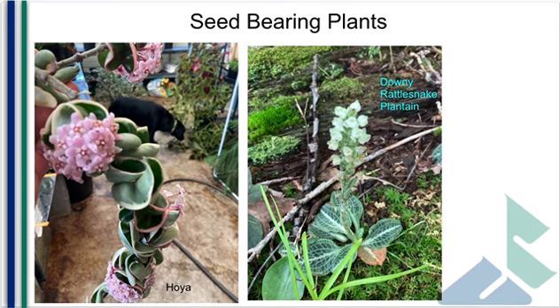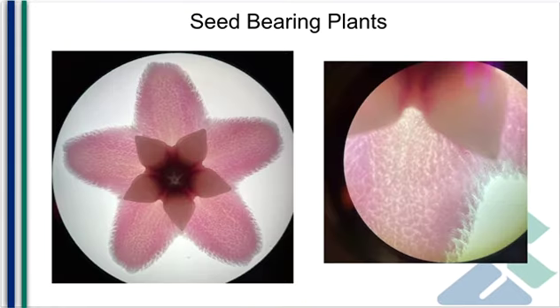And then the real reason why I wanted to show you these plants was because I took some of those Hoya flowers underneath the dissecting microscope. And you can see the patterns of five. The five outer, kind of hairy, waxy structures, the five inner petals, and then even down to the male reproductive parts, the anthers, there are five of them here. So it just kind of matches this blueprint. Let's now head off to the greenhouse and look at some of our gymnosperms and angiosperms there.